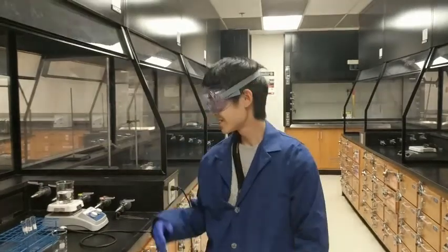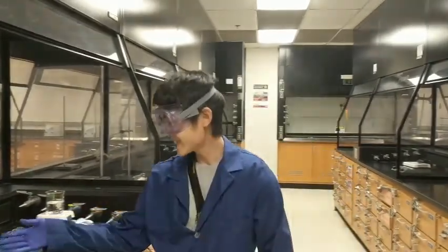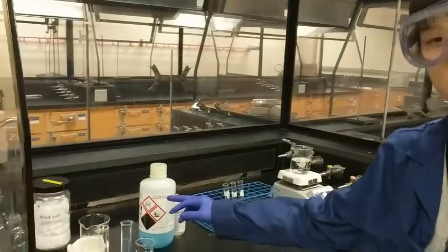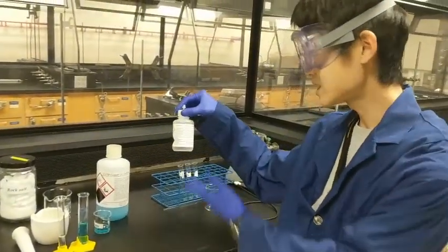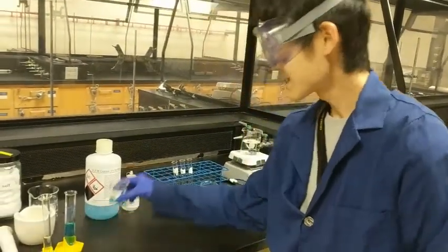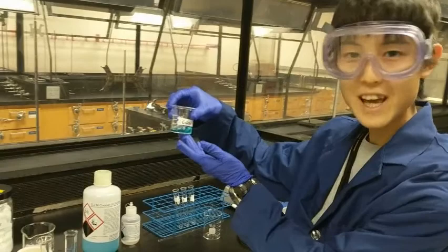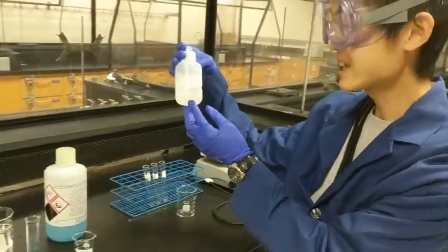Okay, welcome to the experimental part. So in part 1 of the experiment, we are going to manipulate the chemical equilibrium by using different temperatures. So here we have 0.2 molar copper sulfate solution and saturated potassium bromide solution. The copper solution has a blue color and the potassium bromide solution is colorless.